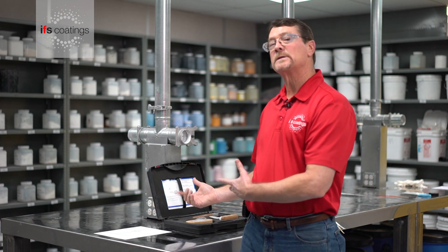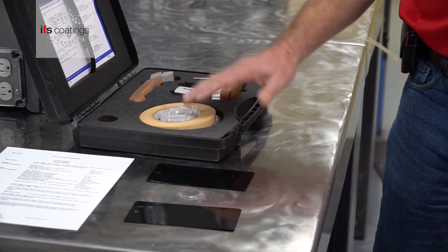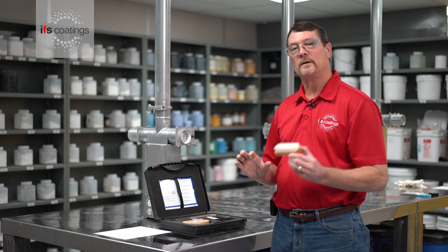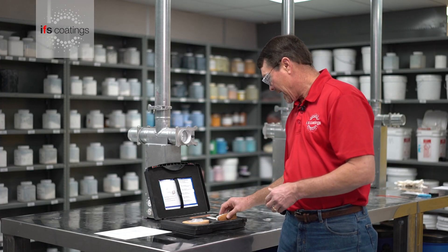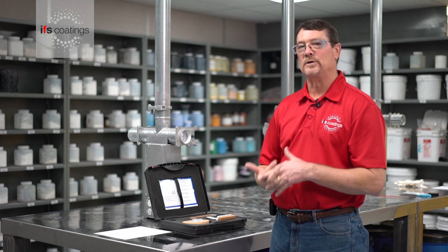Typically what you'll find is the crosshatch adhesion comes in a kit. In this case we have the tape, the crosshatch device, we also have a small brush, and in some cases you can also have a magnifying glass so you can check.